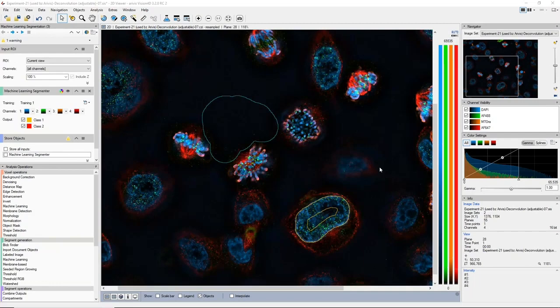It depends on a lot of factors. There's no real reason to think it'll be any worse than with any other type of data. Yeah, I mean, colored images, I'm assuming by colored images you mean RGB images, so probably bright field images. And in that case, yeah, it'll work.